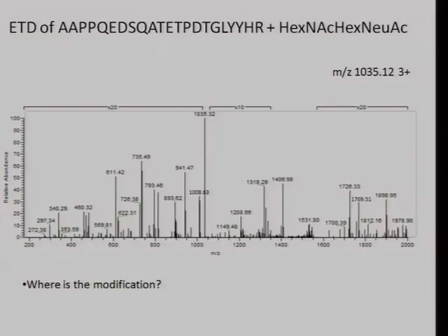So also, we've done this search with a mass modification. If instead we had said consider these 20 different sugar structures, then the software would come back and would have put HexNAc 2, Hex 5 when it saw 1216. It's a function of the way we're doing this initial search to try and be unbiased and say we want to consider any type of structure, and then we're going to explain it afterwards.